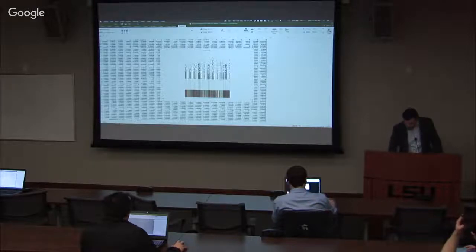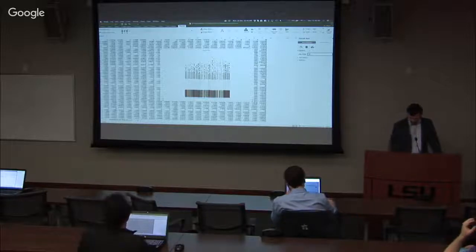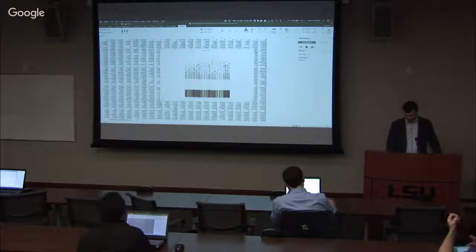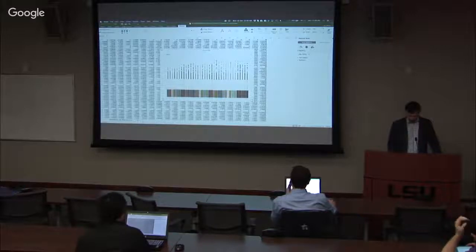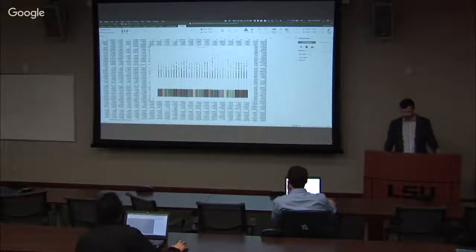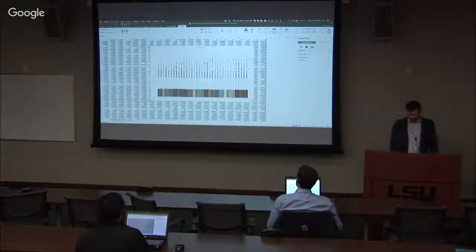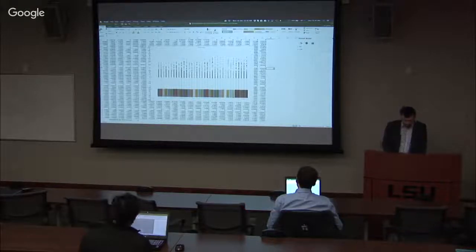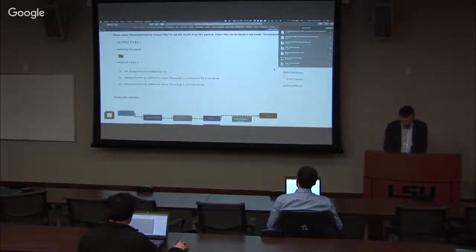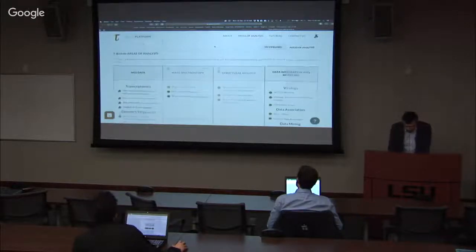And what I want to do is I want to see the impact of this normalization on PCA. So, and I'll explain a little bit more what exactly PCA does again as a review. So here you can see all of our samples, fairly comparable, right? So you can't really tell a big difference, even though you do see a little bit higher outliers on this side. So this data, now before I go into how to interpret this, let's just prepare a couple of pipelines here with this data set.